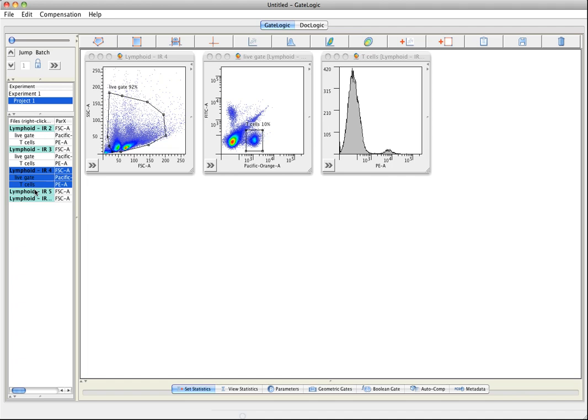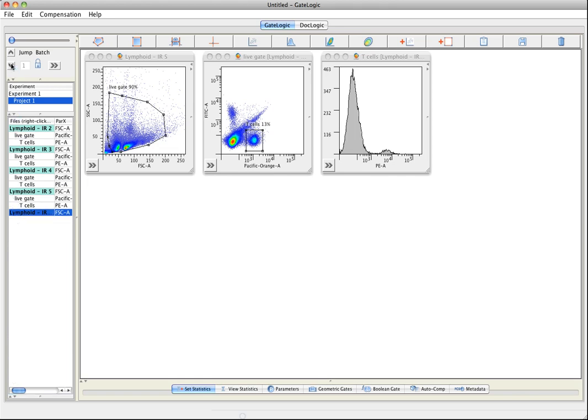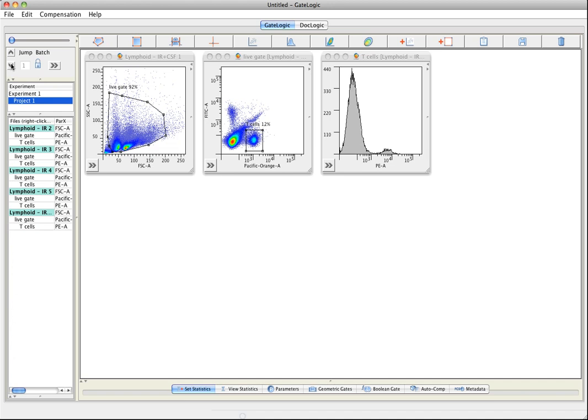Any modifications that will be done will carry through to the next samples. This is a really convenient way to analyze your samples when you are having many of them.